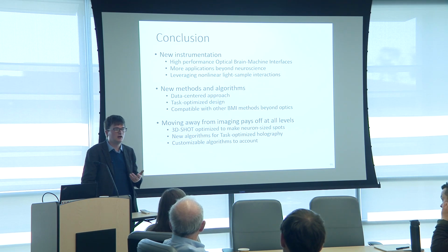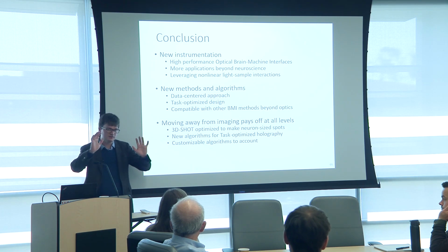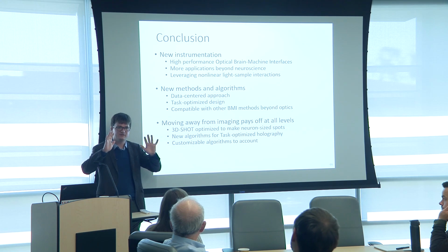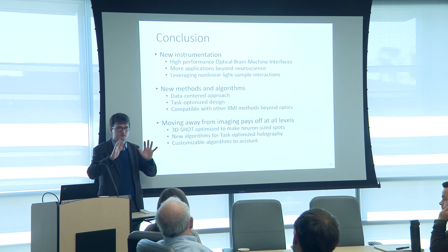In fact, there are two techniques that are in use to accelerate SLMs. One has been developed by the lab of Diesseroth at Stanford that uses two custom designed SLMs that operate already at 500 Hertz. So pour money at the problem, you get an extra 50% speed.